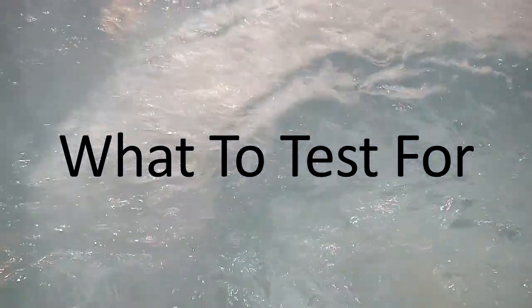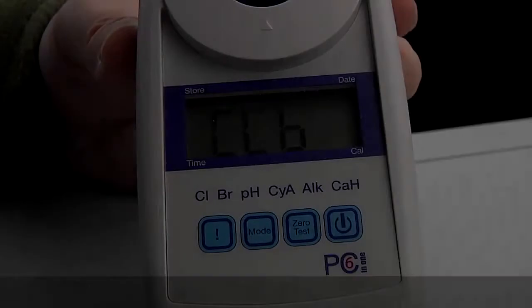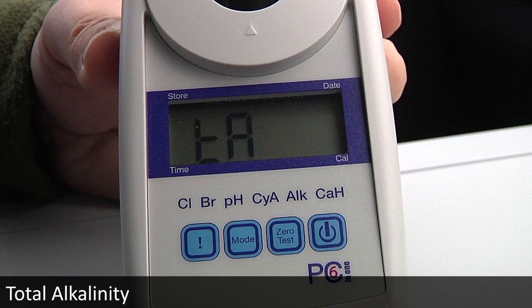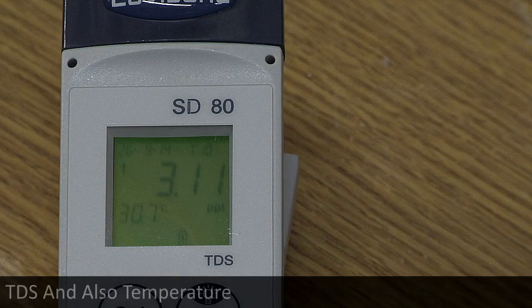There are six primary tests to achieve balanced water: chlorine, pH, total alkalinity, calcium hardness, TDS, and temperature.